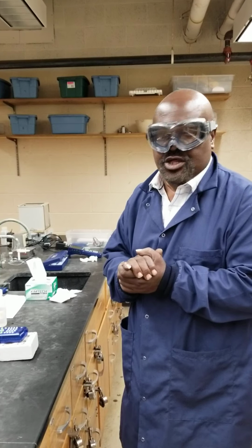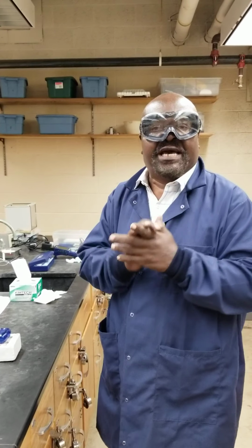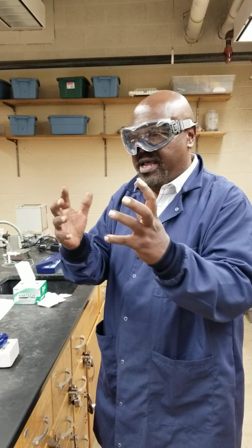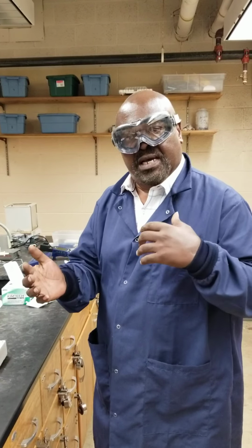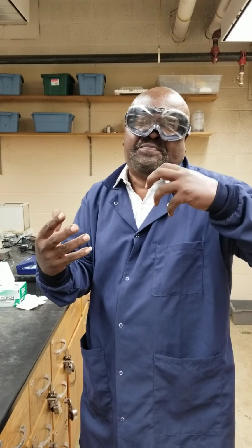the determination of the equilibrium constant for the reaction between Fe3+ and the thiocyanate ion, SCN-, forming a one-to-one complex ion. What is the equilibrium constant? And we're going to do it by measuring the absorbance. You guys are coming from 1510, and so many of you have seen what absorbance is. It's really just color intensity, which is directly proportional to concentration, put in simple terms.